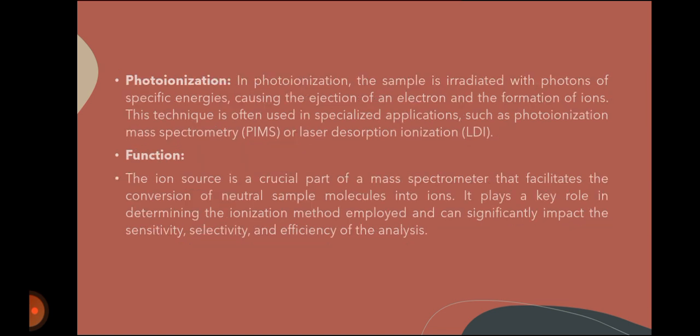Then photoionization. In photoionization, the sample is irradiated with photons of sufficient energies, causing the ejection of an electron and the formation of ions. This technique is often used in specialized applications such as photoionization mass spectrometry or laser desorption ionization. What is its function?